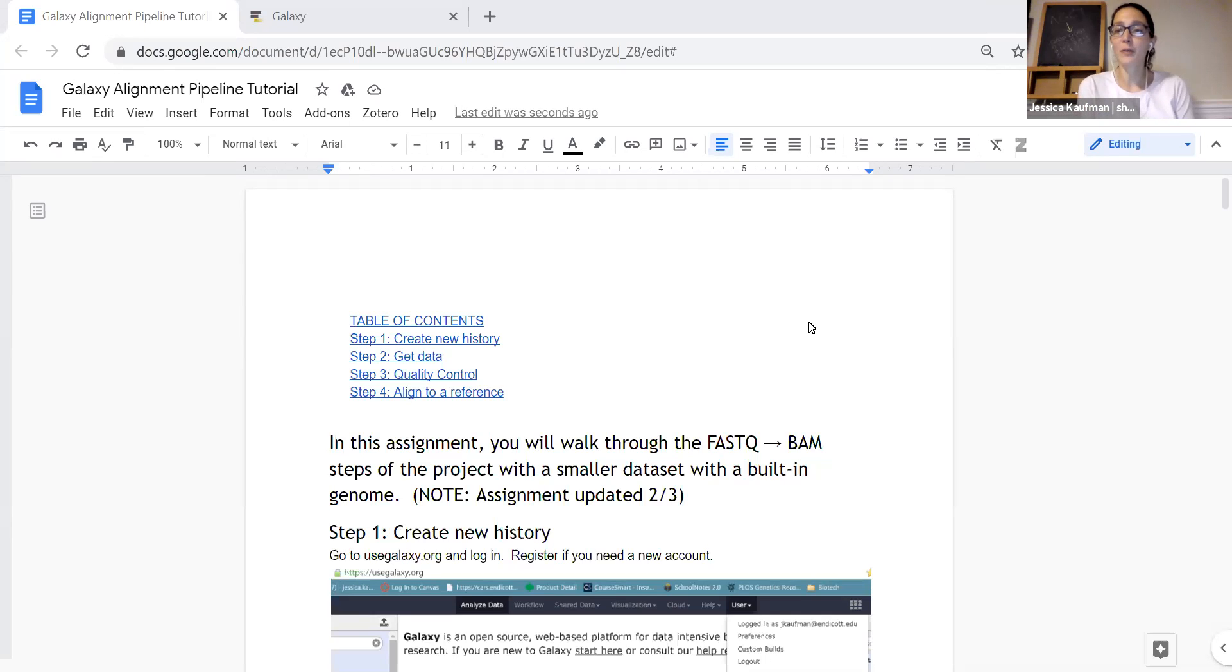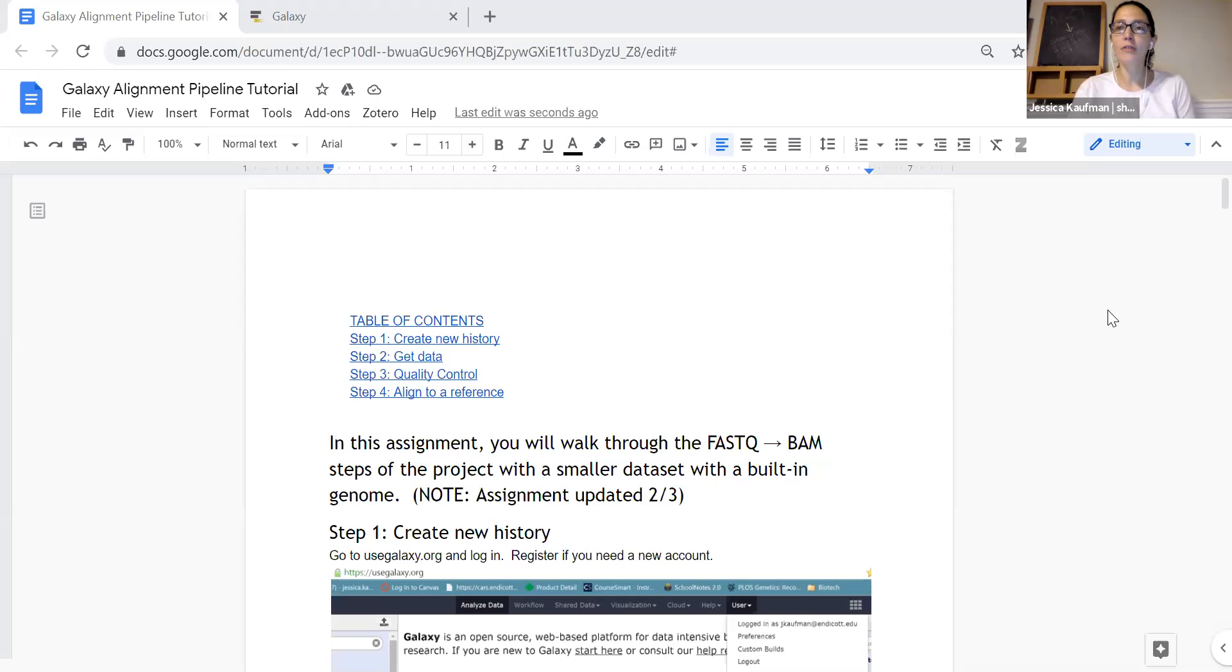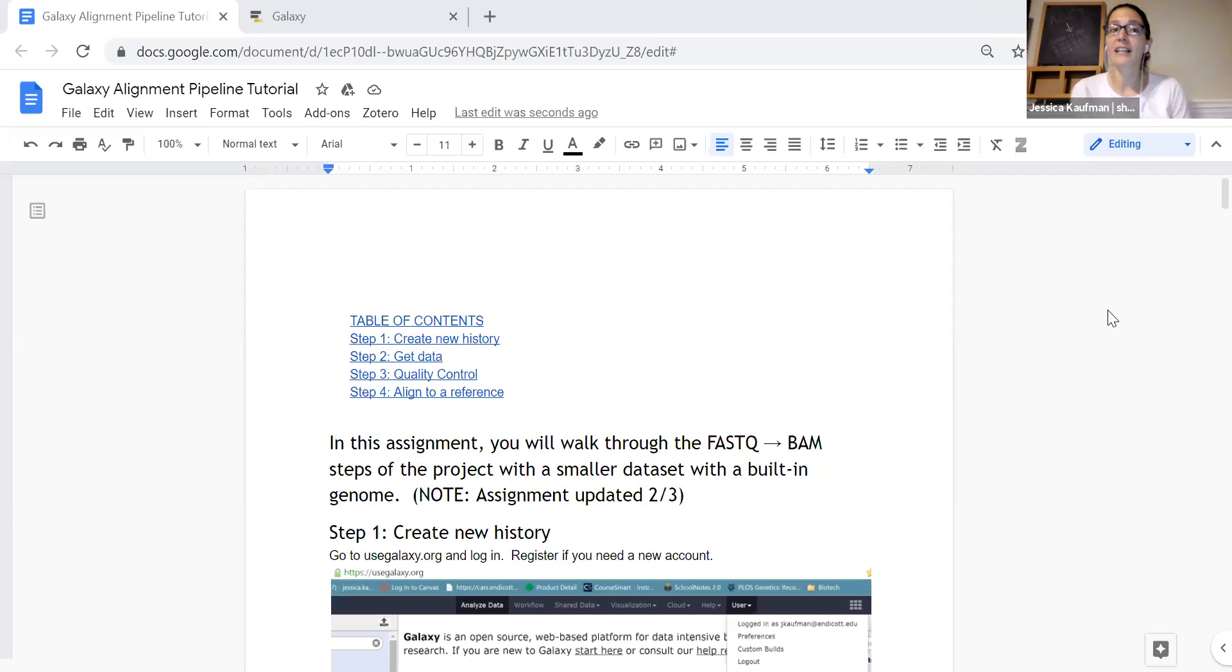Hi everyone! Welcome to week two in bioinformatics. In this video I'm going to walk you through step by step what you need to do for homework 1_4, the Galaxy Alignment Pipeline tutorial.